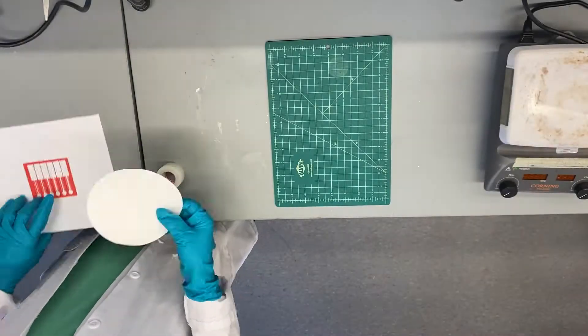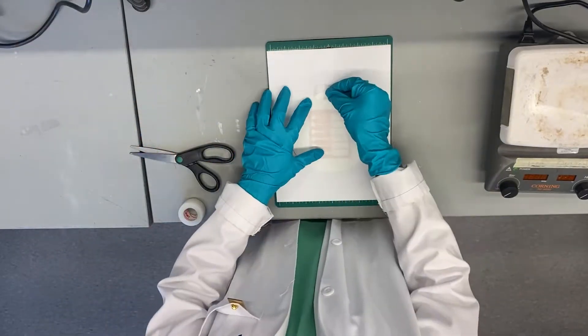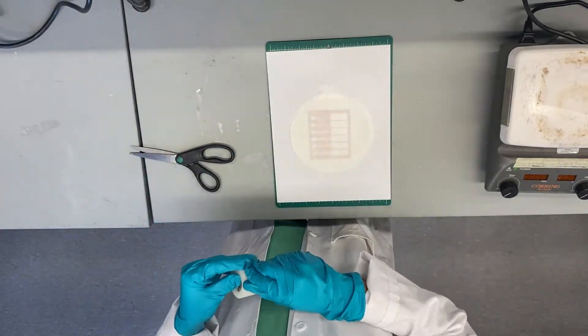Paper Microfluidics Device Setup: Mount filter paper to the microfluidic alignment sheet. Using surgical tape, the filter paper will be mounted onto the alignment paper before being put into the wax printer.